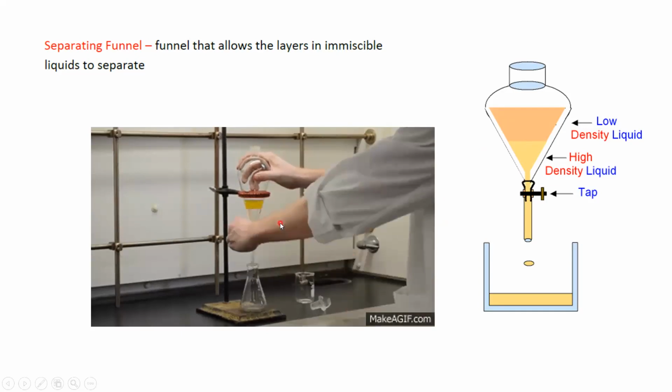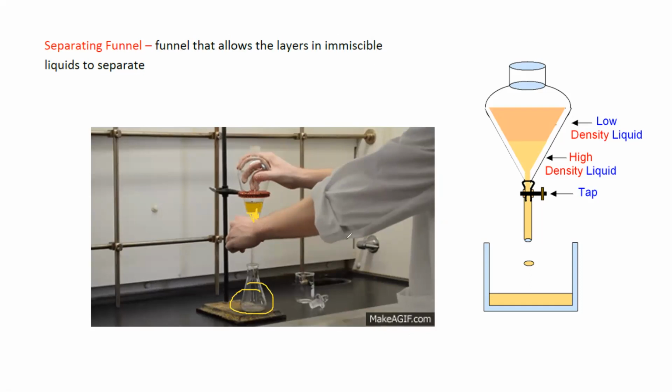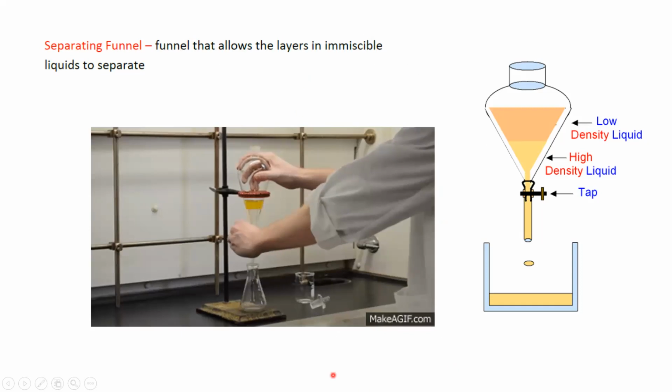As we run down the water, until all of the water is removed from the mixture. So once all of the water is removed from the mixture, we will have only oil, and we will have water inside the conical flask. So this is a technique which we use to separate insoluble or immiscible liquids from each other. Is it clear? The name of this apparatus is called a separating funnel, and this technique is also known as the separating funnel.